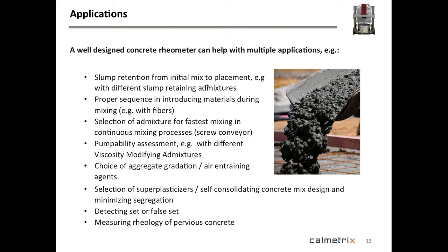There's also a case study that we have in our library if someone is interested. You could look at pumpability. Try different viscosity modifying admixtures and see what their effect is, and see if it's more cost effective or better to use a VMA at a higher dosage rate maybe, or to just increase the paste.